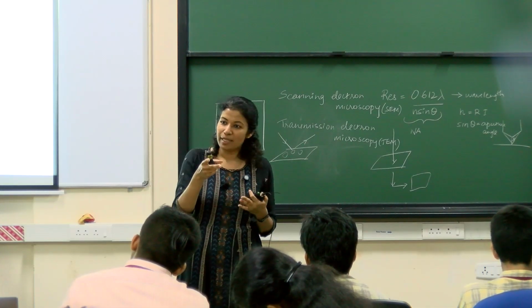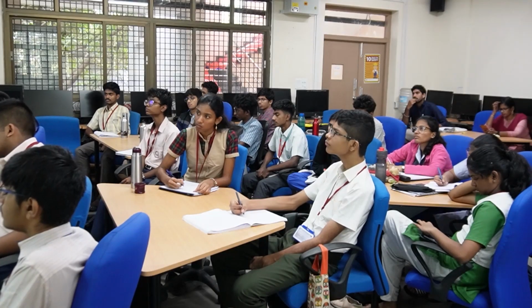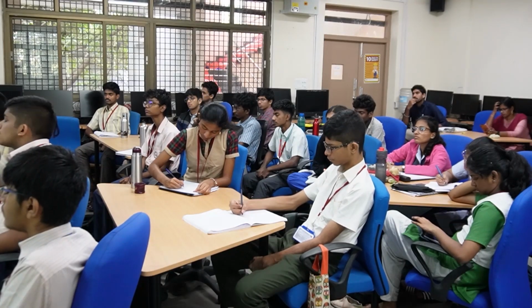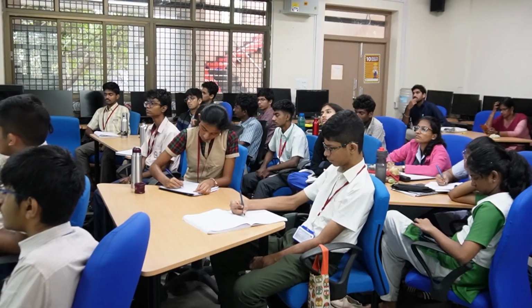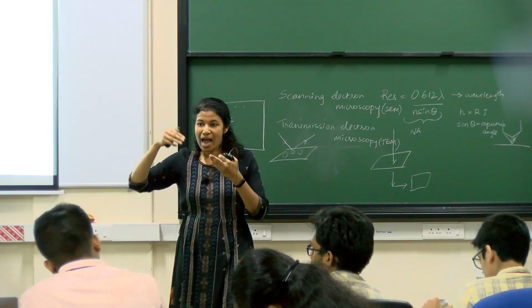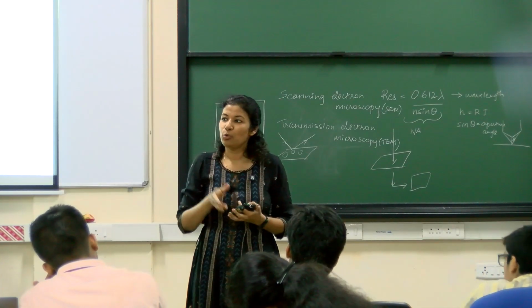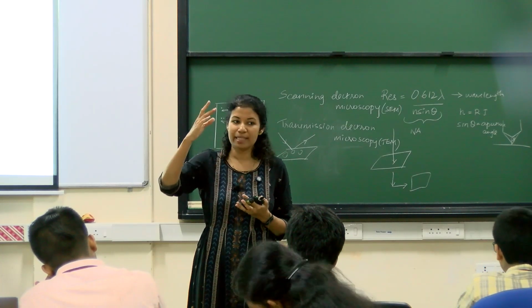So to release it, you can provide energy. That is called the work function. Any metal you can heat up, and beyond its particular work function, it will release electrons, and that you can use as an electron beam.